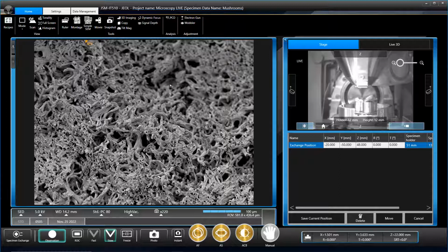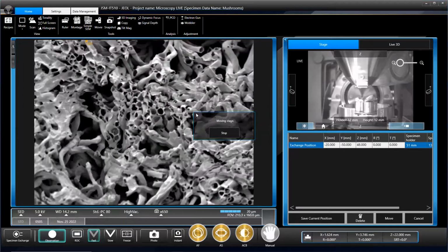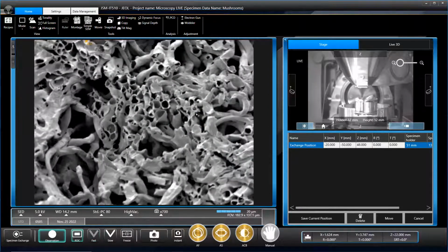It's pretty good. It's complex, isn't it? You can actually properly see in the holes now. Tiny, aren't they? The cell walls of the hyphae are made of chitin, which gives it the support. They're not closely related to plants at all, but they do have a cell wall, much like a plant does.